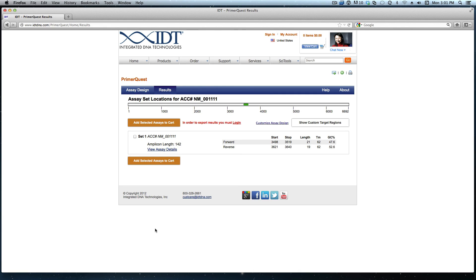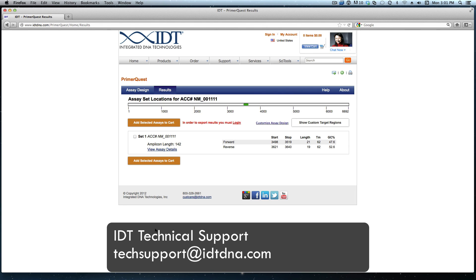Once again this was designing qPCR primers to flank a specified region in my gene of interest. If you have any further questions please contact technical support here at IDT. Thank you.